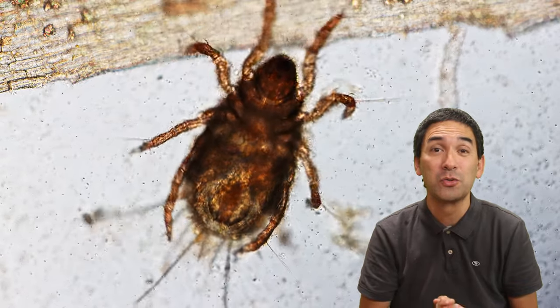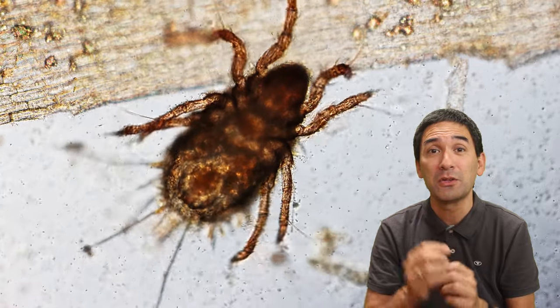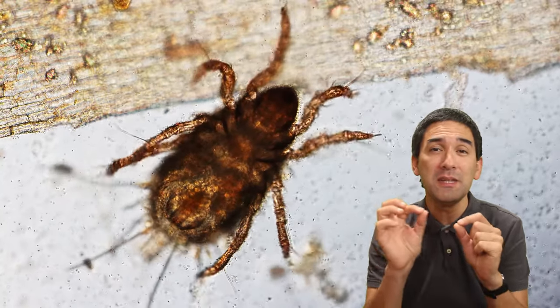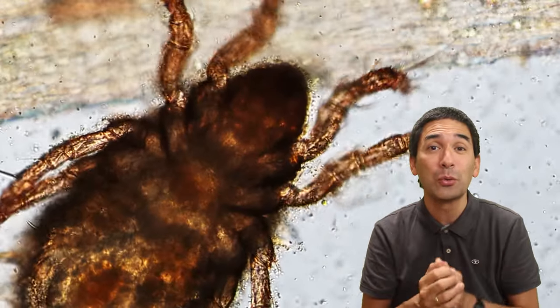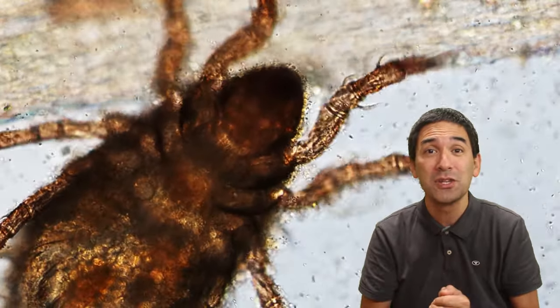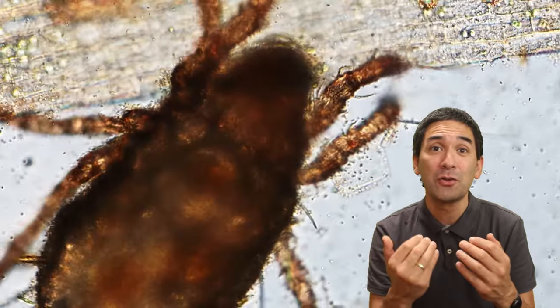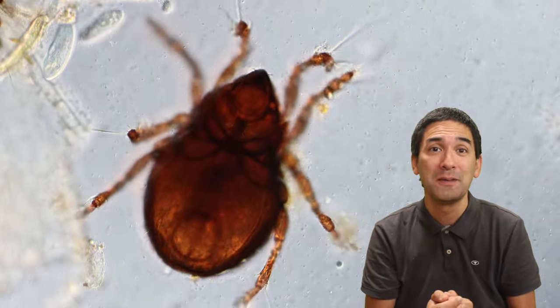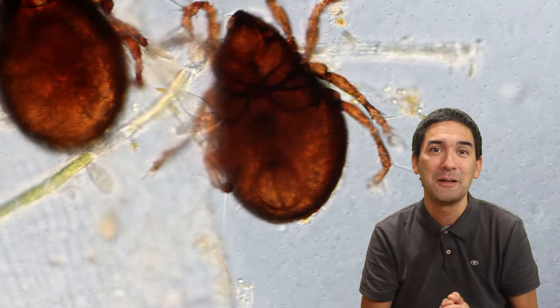I really loved to observe them, and specifically I like to see the size comparisons, because every now and then you can see paramecia and other ciliates floating around. These are single-celled organisms, and the mite, of course, being an animal is made of multiple cells. This kind of allows you to compare the size — like for example here, there are a few paramecia around as well.